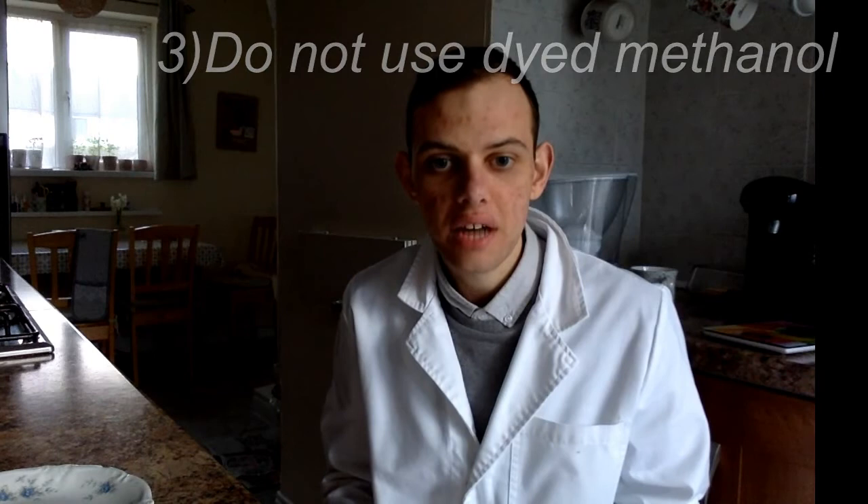Secondly, it doesn't matter how much methanol you use, as long as all of the vanilla sugar comes into contact with the methanol so it can dissolve the vanillin from the sugar. Third, avoid using dyed methanol, as the dye will not evaporate with the methanol but instead will stick to the beaker and mix with the vanillin, making isolation more difficult. Despite that, as you can see, we still managed to isolate it and it is a nice yellow colour and not a purple colour.